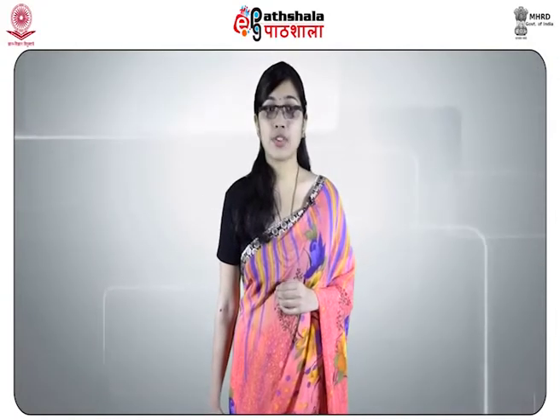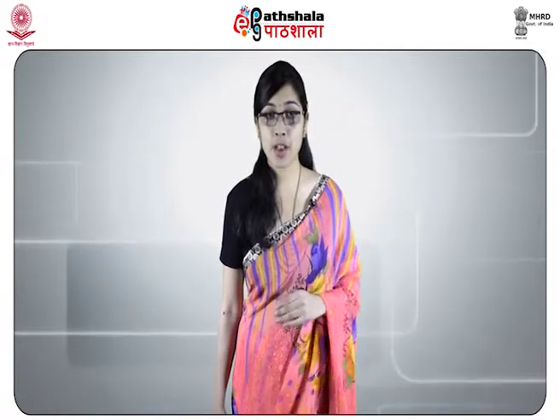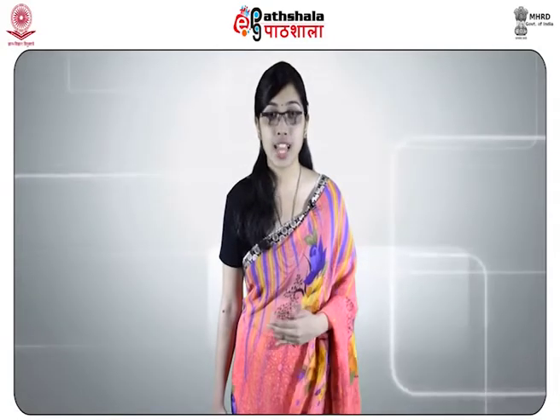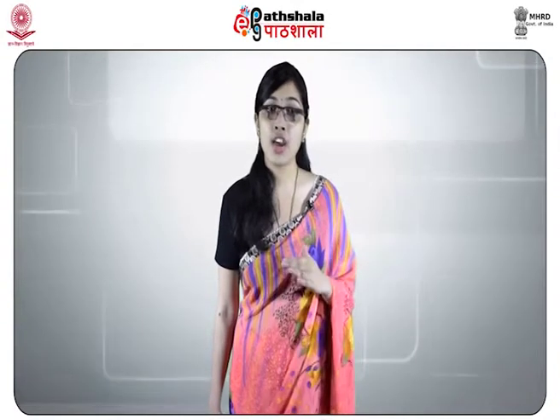Next, we will learn about the microscopic examination of hair. Light microscopy is used for examination of human hairs in the forensic laboratory. Two steps are followed in this examination: the identification of the questioned hair and the comparison of the questioned and the known hair.